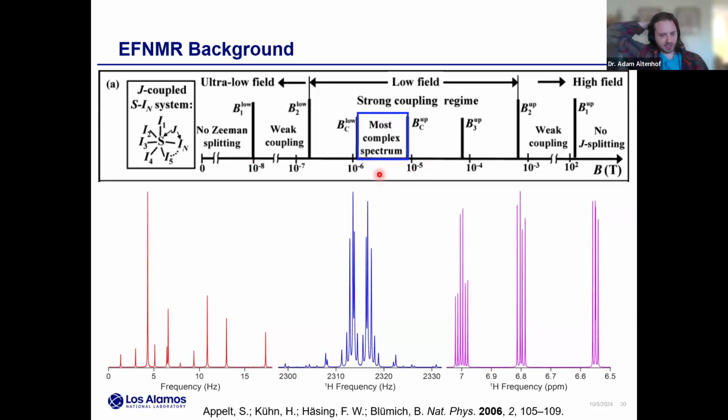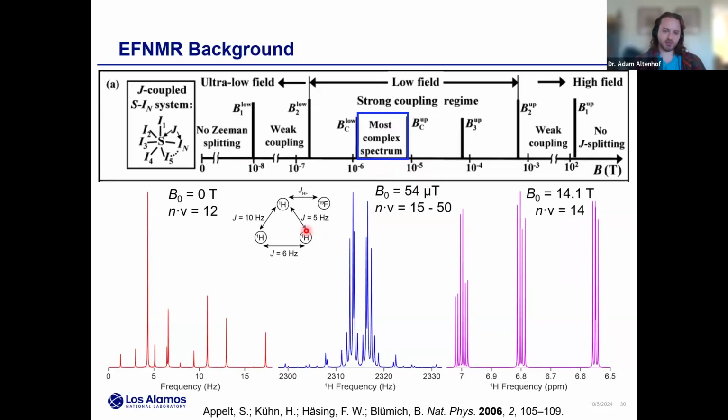So if we look at, again, simulating my weird dreamt-up spin system, if I simulate this at some high field, I'll assign some random chemical shifts for the protons, and we'll just ask the question, how many peaks are there? In this case, there are about 14 peaks if you could resolve them. If you go to zero field, just measuring the J coupling, we end up with something like 12 peaks, could be 24 if you count it symmetric.